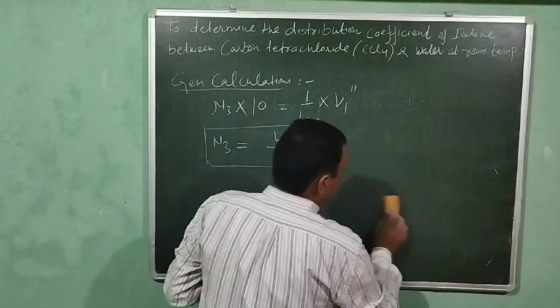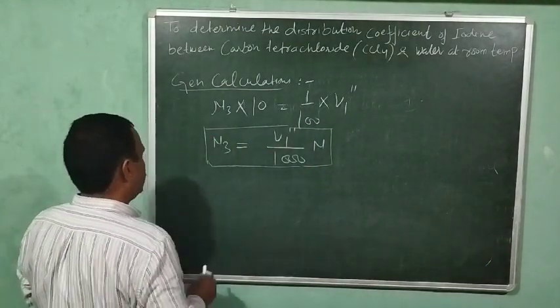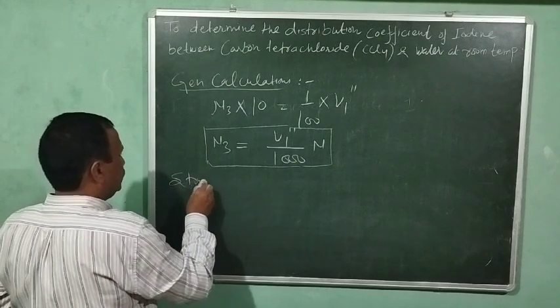Now we will calculate the strength of iodine.